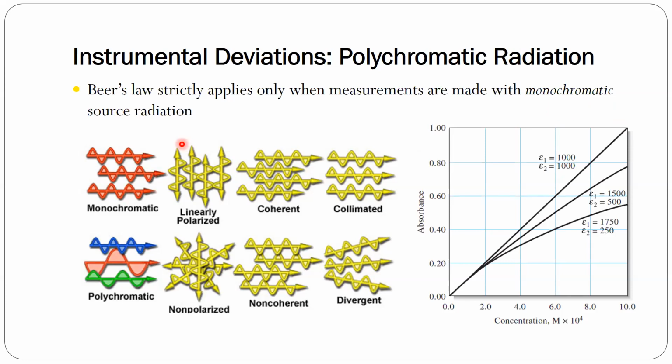Okay? Older instruments, hindi masyadong monochromatic ng radiation nila. Newer instruments, so they have this kind of radiation. But what we do if you have a polychromatic source of radiation is that you install diffraction gratings or other optical instruments that will somehow change your polychromatic radiation into monochromatic radiation. Ibig sabihin, pinifilter mo yung light in the process.